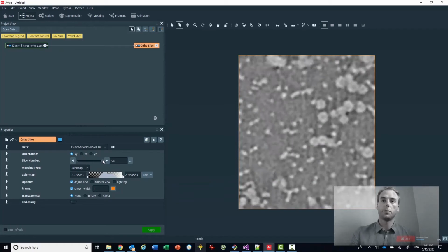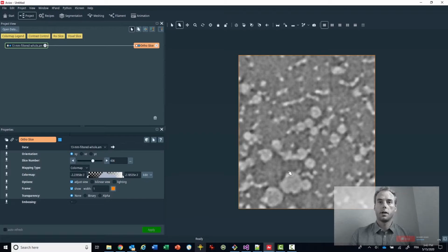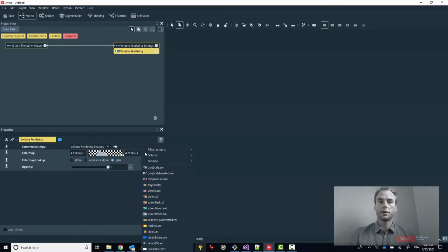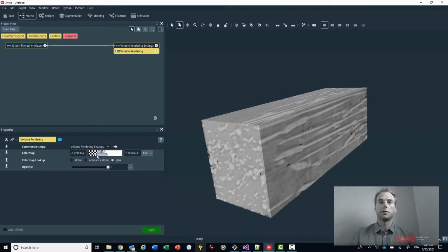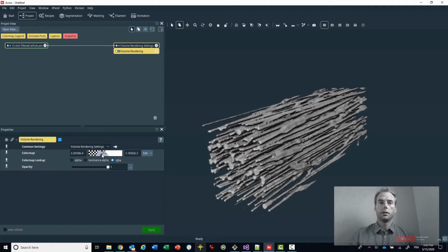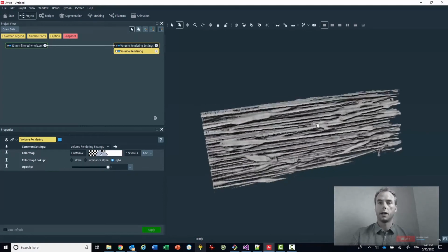So here's a dataset of polyester fibers with different levels of diameters. The big ones, the medium ones, and the small ones. We can even visualize the dataset in 3D, so you can see how all the fibers are oriented in space. And as you will notice, all the fibers are pretty much aligned the same way. They are rather straight. The only difference is that they do not share the same level of thickness, therefore diameters.